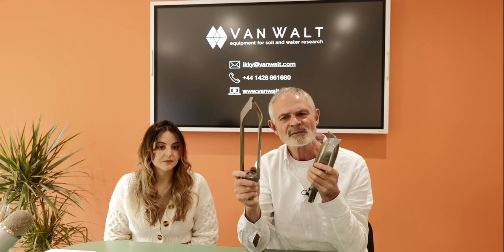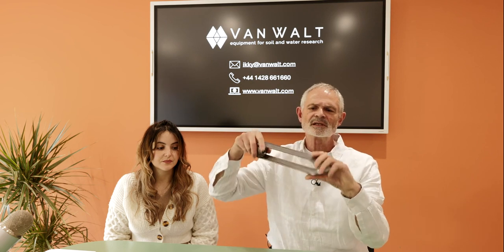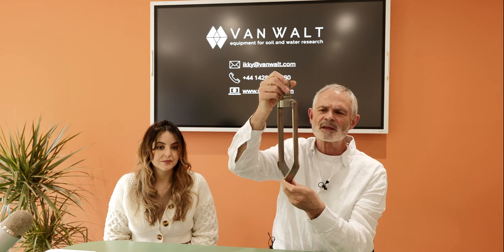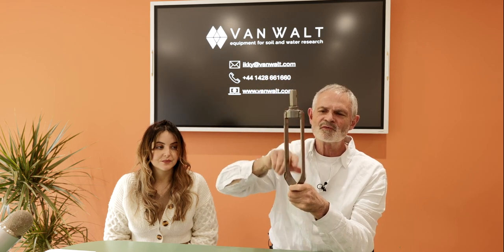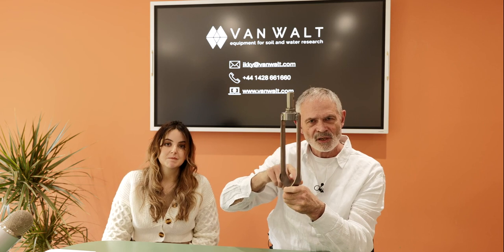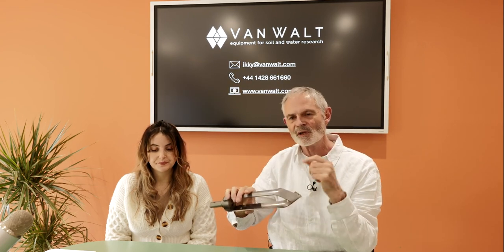And incidentally, any of the hand augers take what we call semi-disturbed samples. So whereas you can certainly work as a profile, within that profile is relatively undisturbed, in fact pretty undisturbed. Why we call it semi-disturbed is, of course, you're twisting this, and in twisting you're actually mixing up the sample a little bit, which is why we call that semi-disturbed rather than undisturbed sampling, which you would do with tools which we will show you a little bit later on.